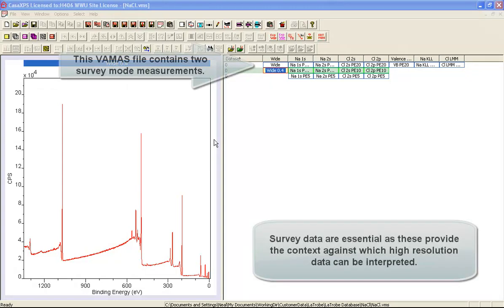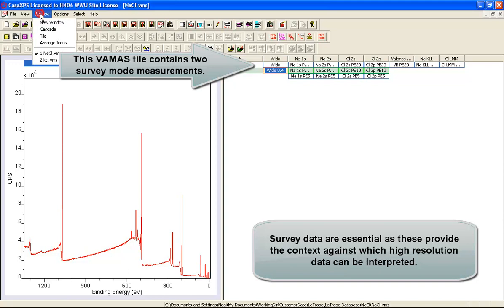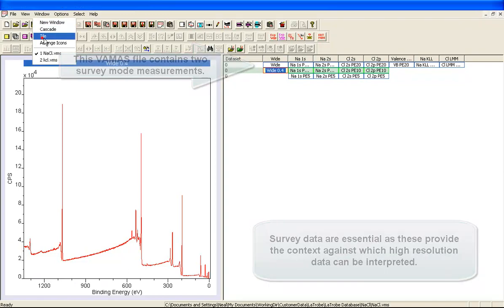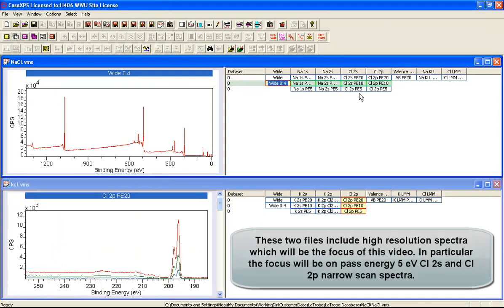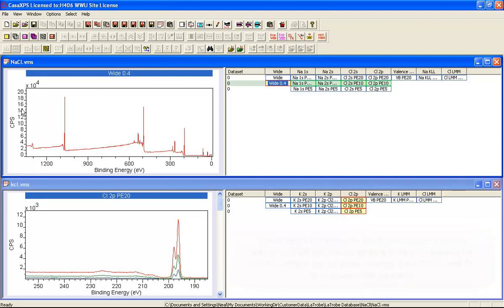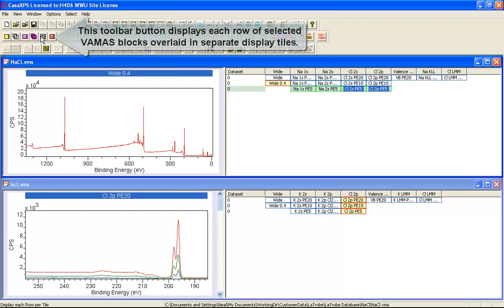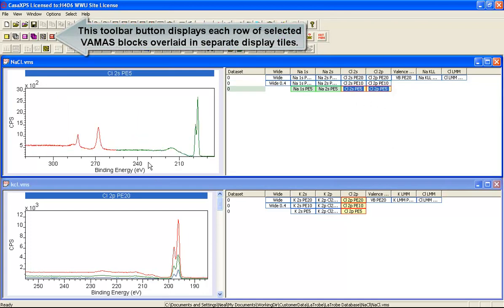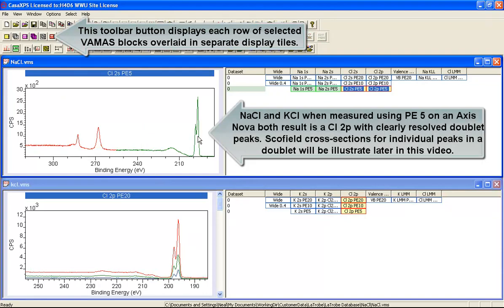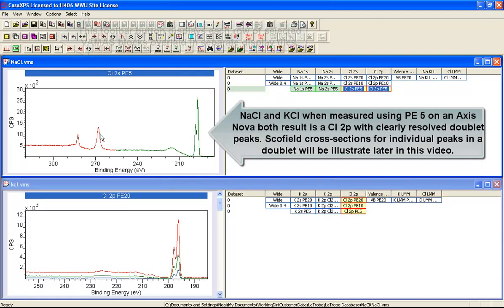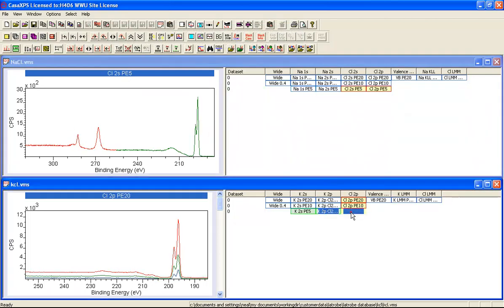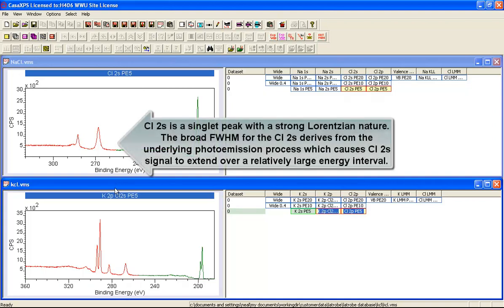The database includes a number of files with a range of different materials. Two have been selected so that we can have a look at the difference between the chlorine 2S and the chlorine 2P in two different materials, potassium chloride and sodium chloride. If we look at the sodium chloride we've got a chlorine 2P, a chlorine 2S and a carbon 1s.